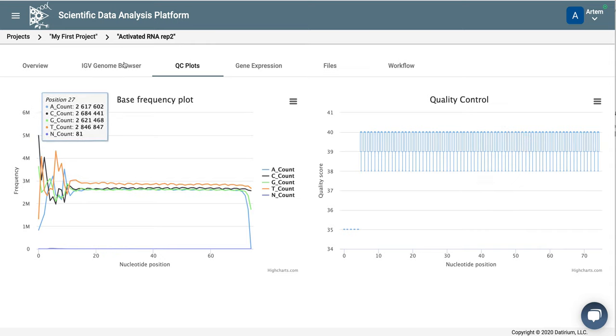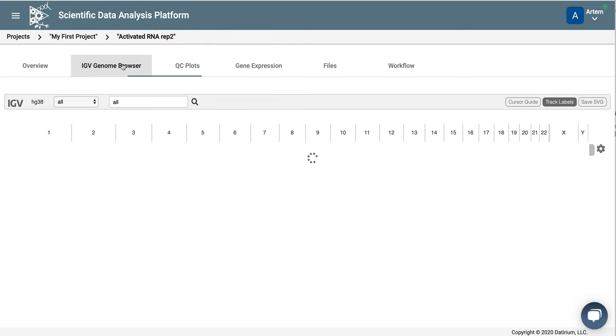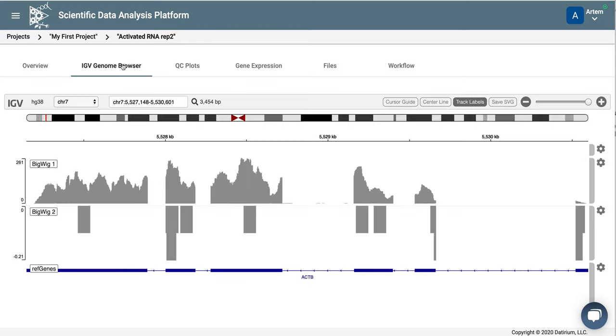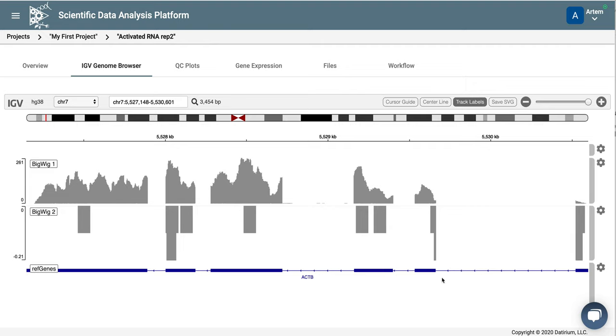Let's look at our results on the genome browser. So you can see that we have two tracks on top. These are reads that are mapping to the top strand, and on the bottom, the reads that are mapping to the bottom strand. The ActinB gene is going from right to left, and the reads actually, in the dUTP method, map on the opposite strand, so to the top strand.